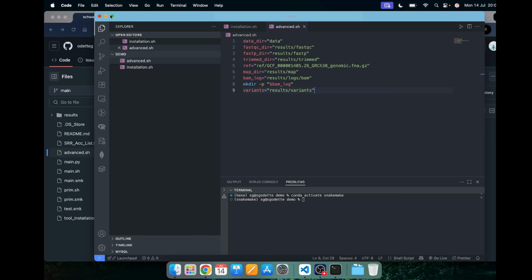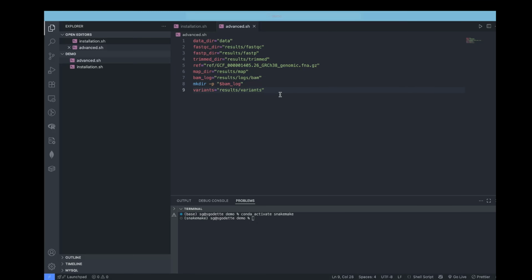Now I will just enter into full mode. So one of the things that we can start with is verifying whether our script is running, and for that I will just write a simple echo command here just to tell us it's running, and then come here, clear my terminal a little bit, and then try to run the script. One of the ways you can run scripts in your system is basically to click here. But for me, I usually prefer to run it from the terminal.